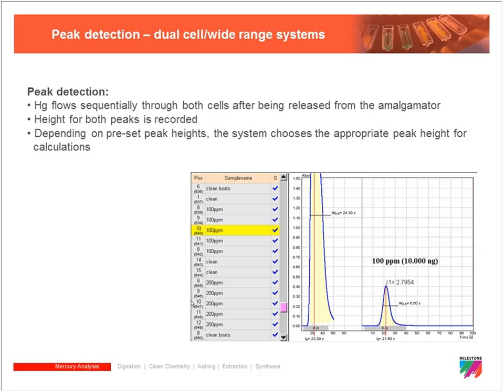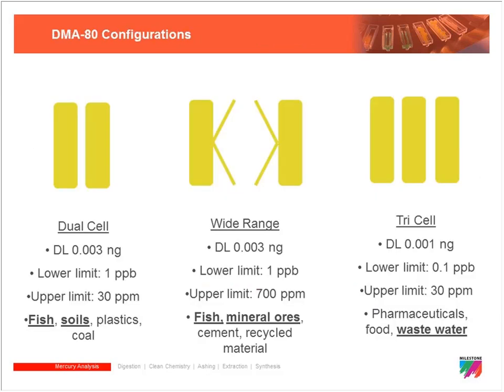These peak heights are great tools to help us identify issues and challenges with the instrument. If we're seeing tailing or subdued peak height, anything like that really helps the troubleshooting process.